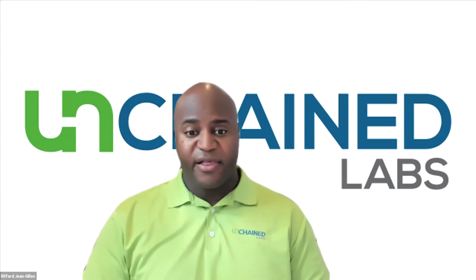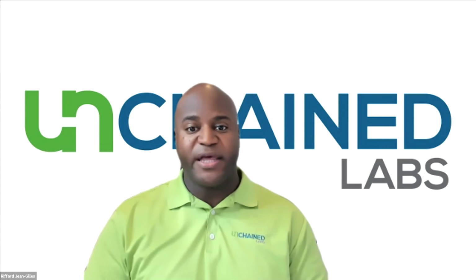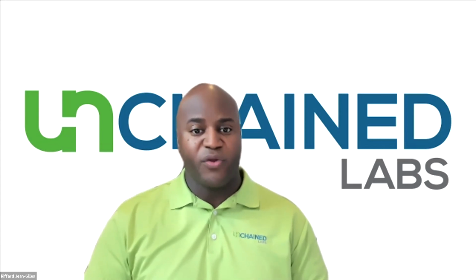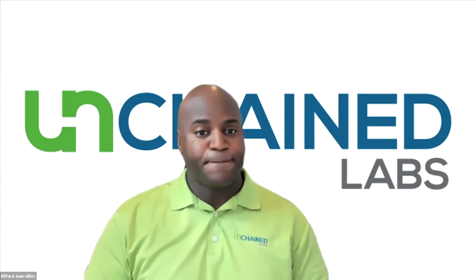Okay, let's see, some of the technical questions. What else we have? Okay, so I watched some of your AAV SYPRO Gold webinars. Is it possible to do this using intrinsic fluorescence? What other dyes can you do? Yeah, so two questions there. Is it possible to look at AAVs with intrinsic fluorescence? The answer to that is yes.